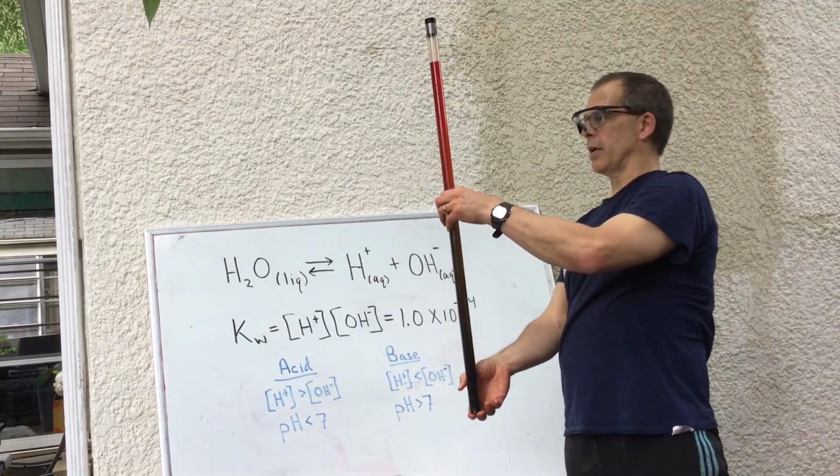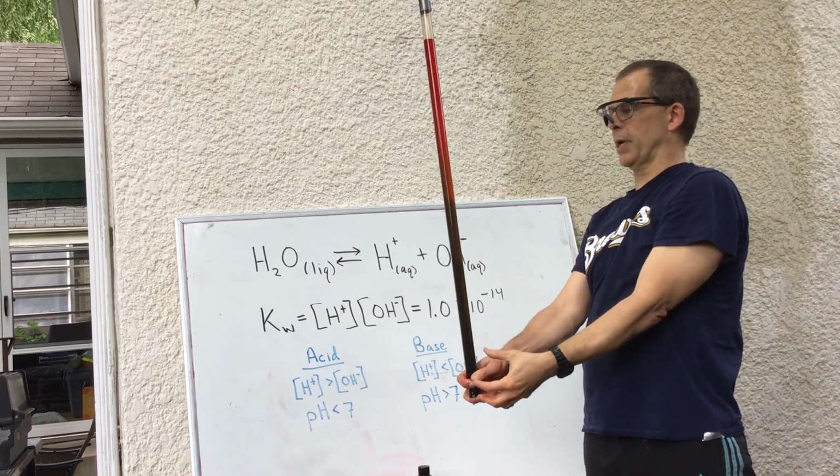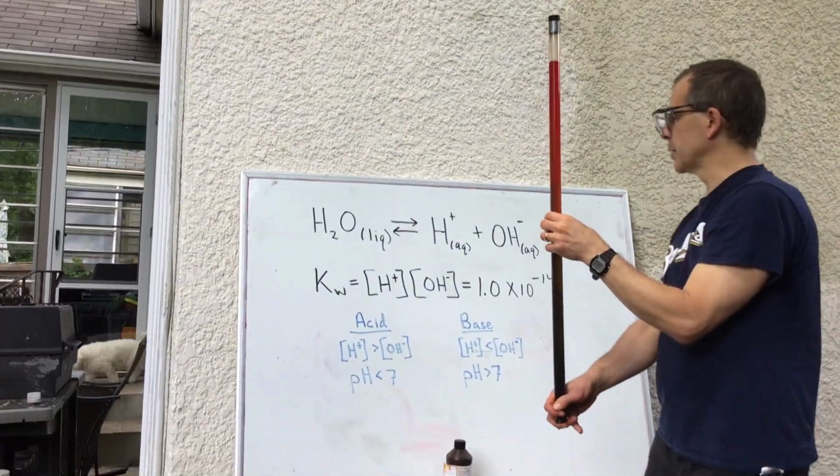Okay, ultimately, if this thing turns and mixes around, it'll probably blend and be neutral, assuming I added the same amount of acid and base to this, and it's going to balance out, but it'll take a while for it to mix.